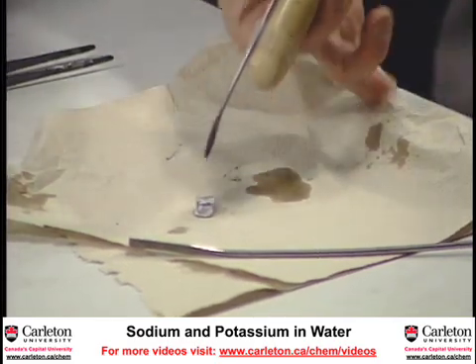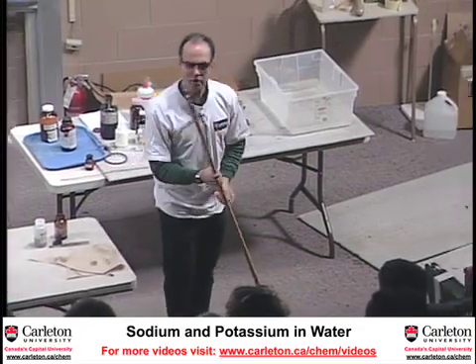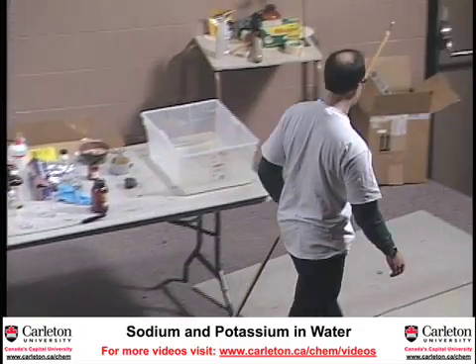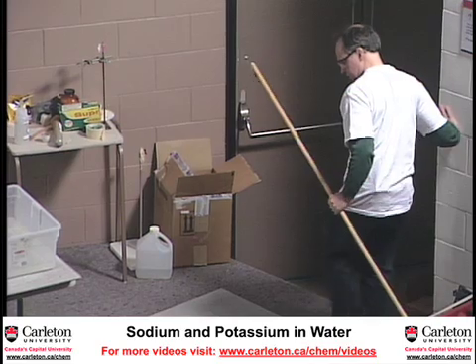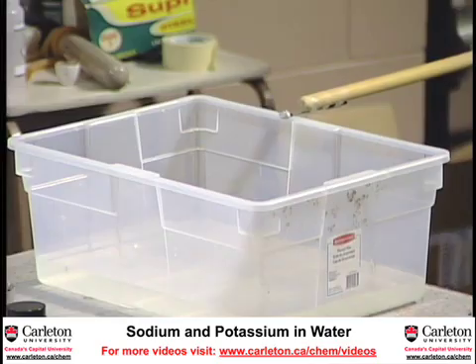Now these are interesting metals because they're very reactive. And this is a good demonstration of why firemen want to know what's in my laboratory before they come running in with their hoses. Because if you want to put out a sodium fire with water, that would be the wrong thing to do.